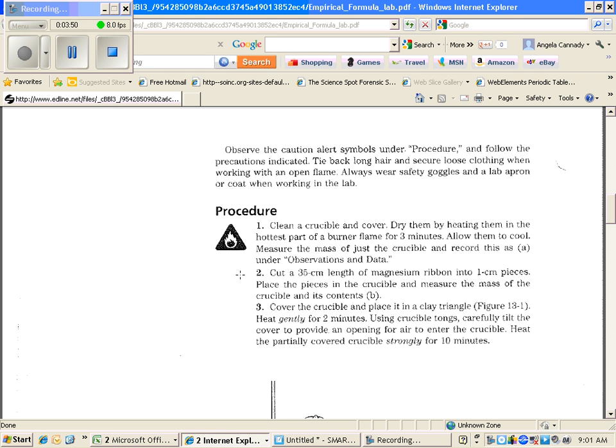You're going to get a 35-centimeter length of magnesium ribbon. You're going to cut it up into one-centimeter pieces. It doesn't have to be exactly one centimeter. You can just chop it into little pieces so it fits into the crucible. Then you're going to measure the mass of the crucible and the contents, the magnesium ribbon.